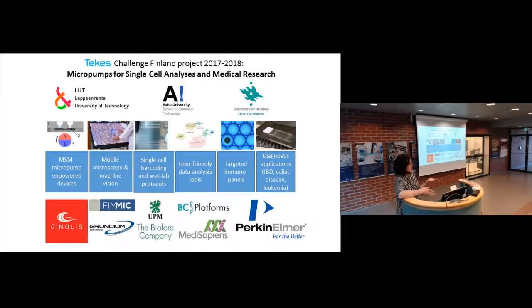So with, for example, micro pumps, if we can do it and the chip costs just €1, I think there is something to think about. What is the real cost of these devices? Of course, you have to think about optimizing and making the reagent kits and so on, so you can't sell it for €1. But chips are not expensive, and pumps are just pumps.